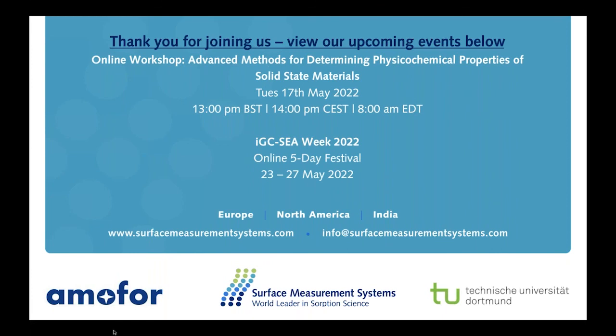The way we choose is more to do with the trends we receive in our data and the temperature at which we ran the experiment. For the Schultz method, this was done using a range of different quoted values in the literature that were performed at 25 degrees C. So these were the surface tensions and surface energies of a bunch of liquids under ambient conditions. Whereas the Dorris-Gray method has a temperature term accounted for within it. So this is more appropriate to use at elevated temperatures, or if you're using some slightly harsh conditions.